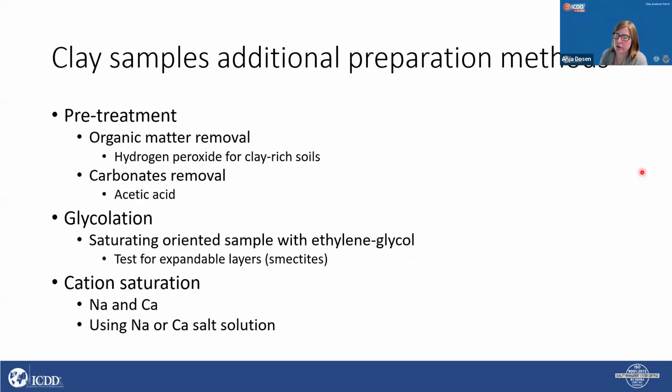There are some other specific treatments that we tend to do that help with characterization of clay minerals. I have pre-treatment here, which is not something we're going to focus on this time, but there are some pre-treatments that can be done as well. What we tend to do is saturate clays with some polar or organic molecule, for example ethylene glycol, which is most commonly used, because it's big and it will enter the interlayer spacing of expandable clays, and we will be able to visualize that on the X-ray diffraction pattern.